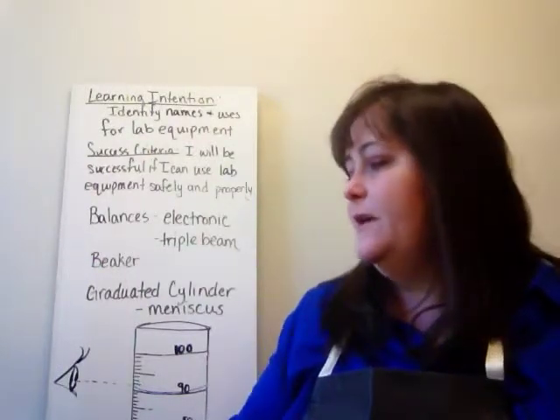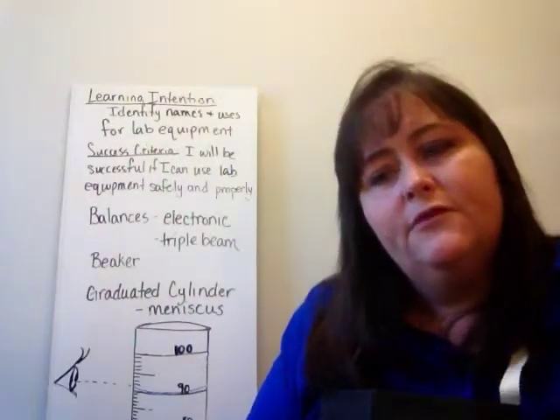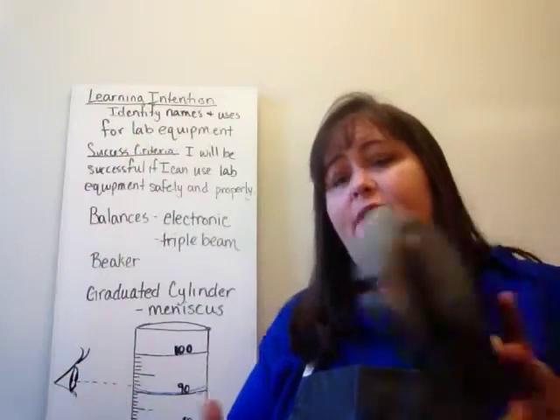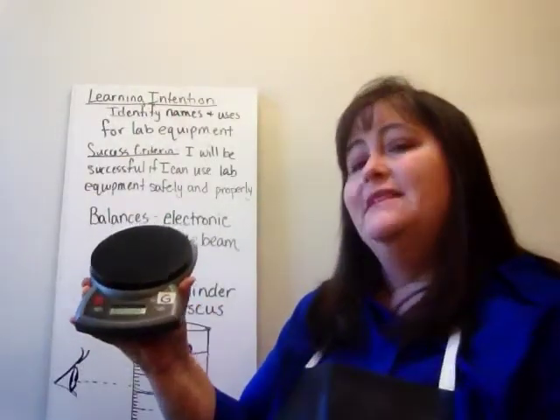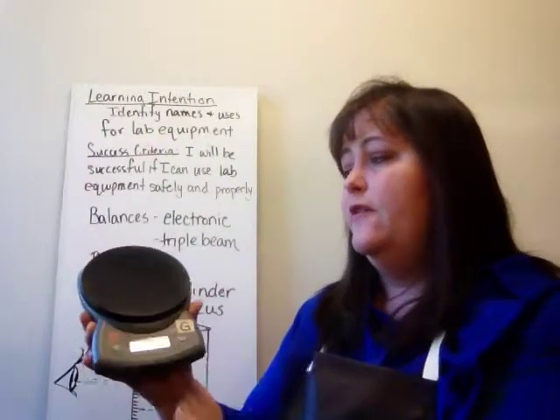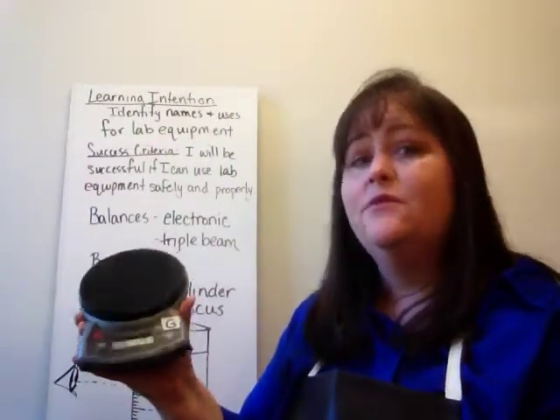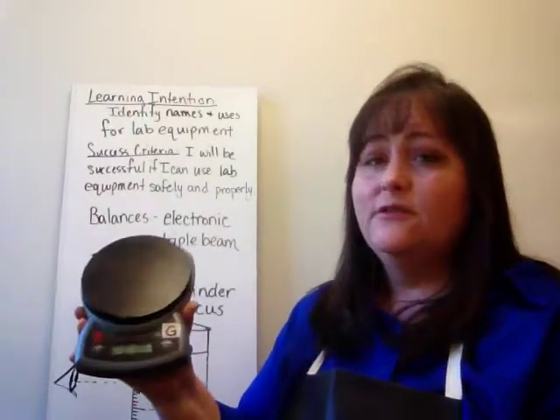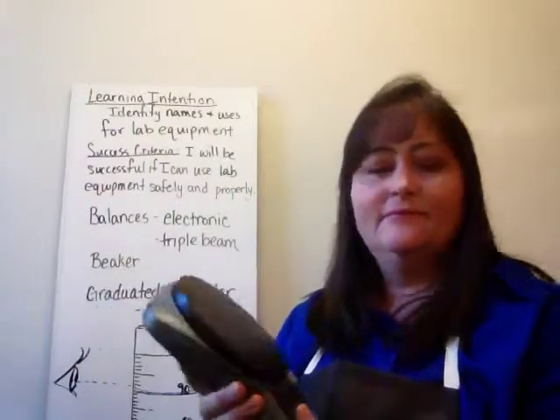The first thing we're going to talk about is an electronic balance. Electronic balances are pretty simple to use. They're the easiest kind of balance to use. All you have to do is turn them on, wait for it to come to zero, put your chemical on the plate, and then it'll give you a readout either in grams or ounces. We usually use grams because that's the SI unit for mass.